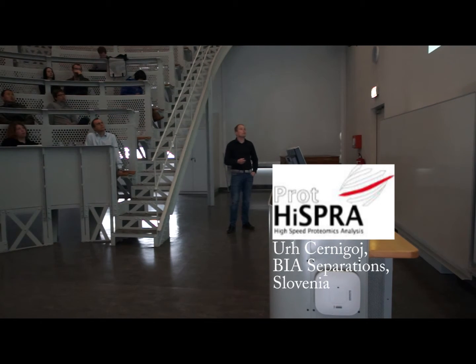This was also proven with XRD: before and after regeneration, the titanium dioxide is still on the monolith. And now the chromatographic evaluation of these titanium dioxide columns. Because, as I said, we are focused more on preparative purposes, we wondered what the capacity would be, for example, for one phosphoprotein.